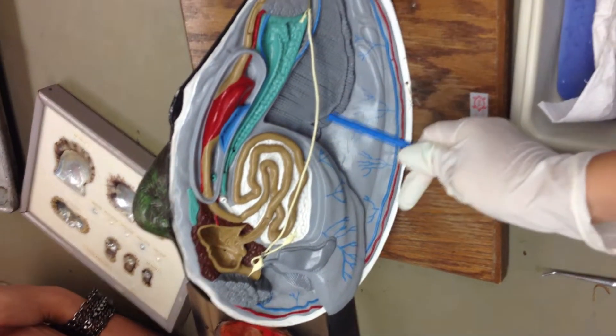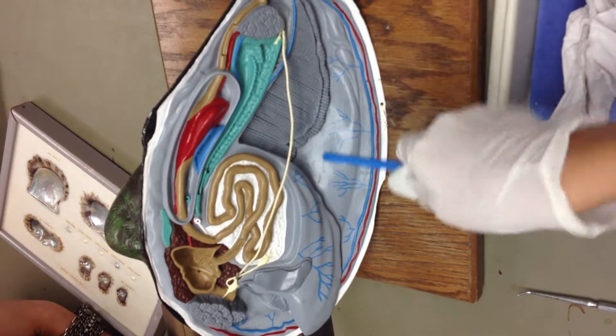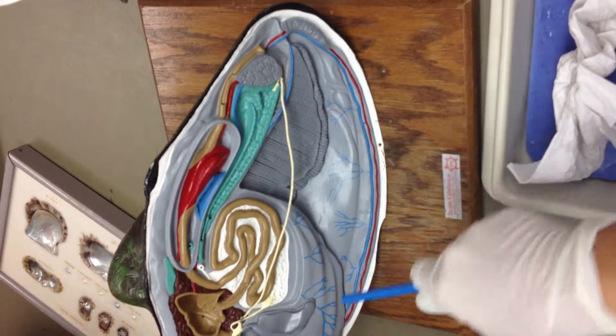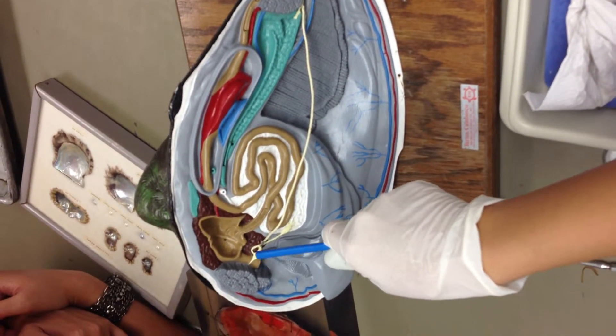This stringy thing is your ventral nerve cord. That's your gills, foot, oral palp, and supposedly that's your ganglion.